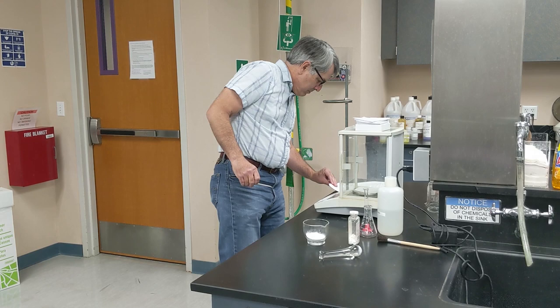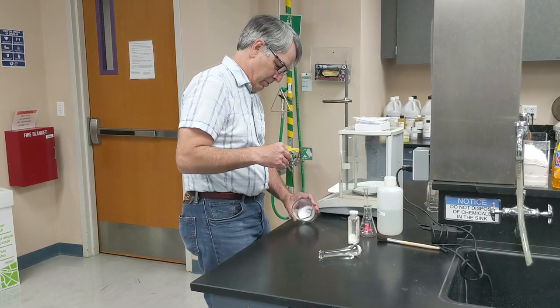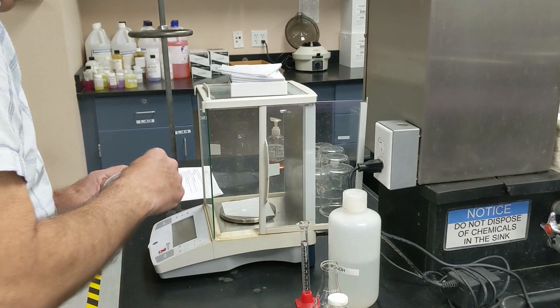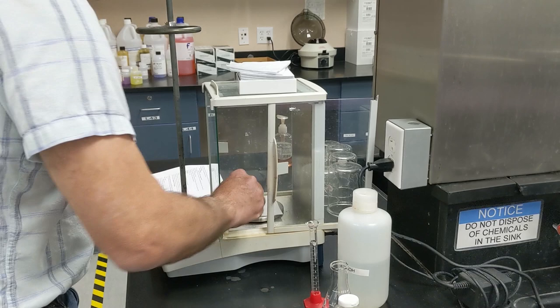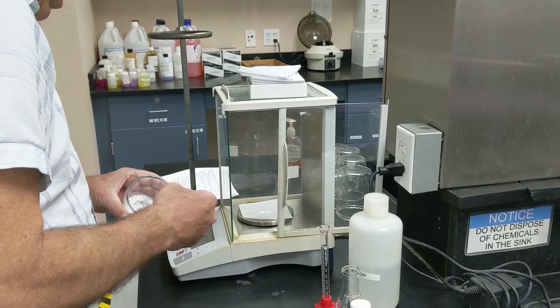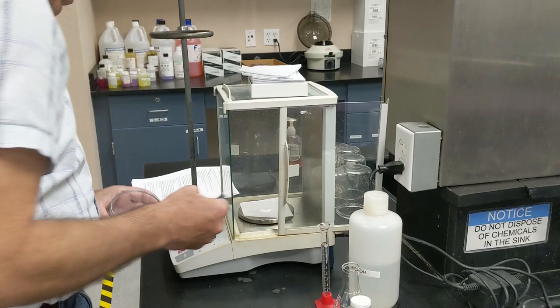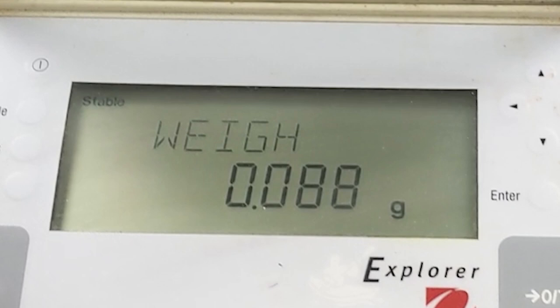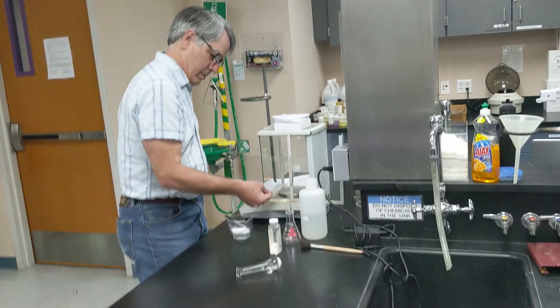It says between 0.075 and 0.090. So let me put this on the weighing paper. Maybe I could have used a better spatula. All right. So go ahead and take a note of that mass measurement. You'll need it in the calculations. And then I have to add this to an Erlenmeyer flask.